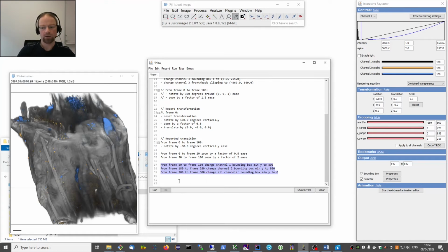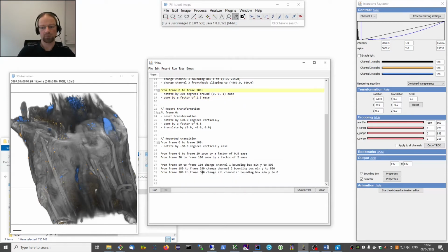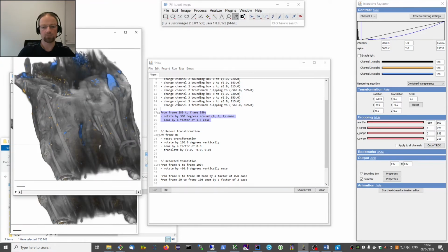So now, after this cropping, I would like to do the rotation, and we have it here. So we'll just re-enable this rotation again, as we had it. But we need to change the frames, so we would do that just after this. So maybe from frame 300, or let's maybe again start a little bit earlier, so maybe 280 to frame 380, and again, maybe we just look what this looks like. So again, I select this frame range here and click on the run from 2 and OK. And so we see as it drops back.